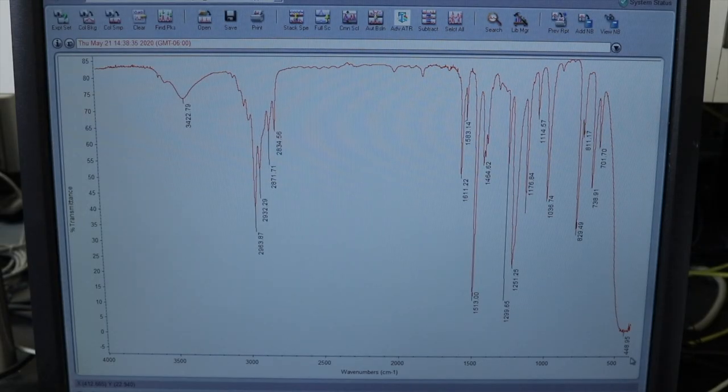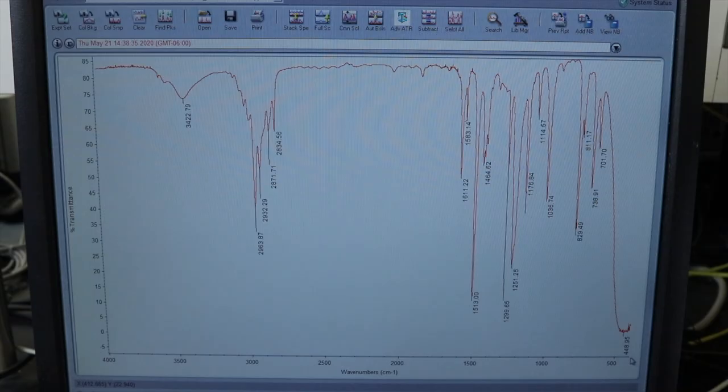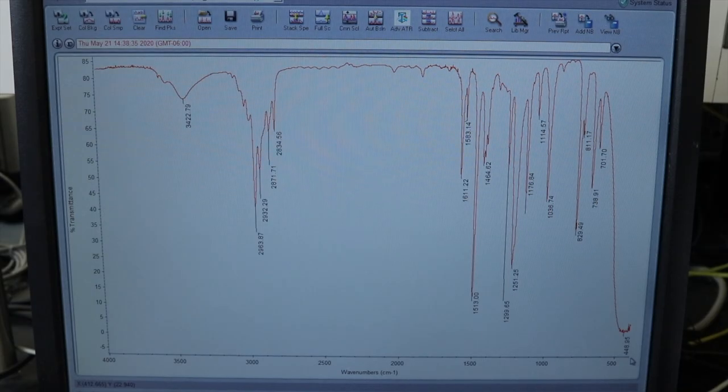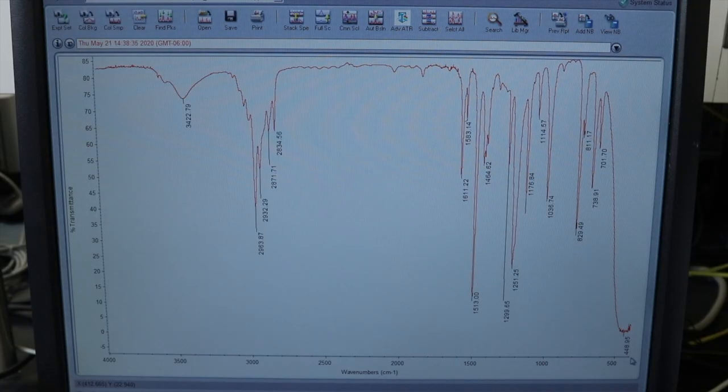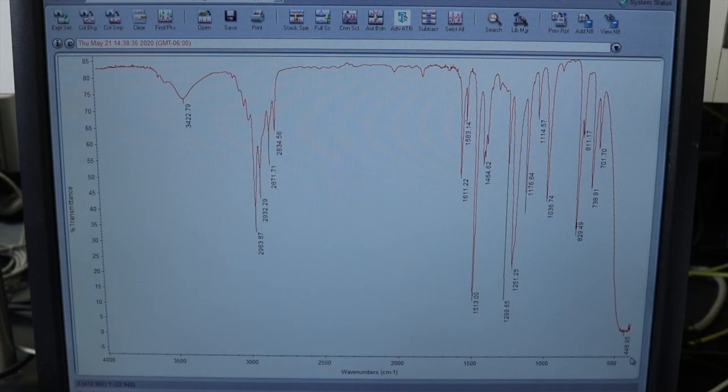Unfortunately, there's a little bit of OH contamination, possibly from the phenol reagent left over. But other than that, it looks pretty good. We have the two carbon oxygen peaks for the ether group, one at 1250 and the other at 1036.